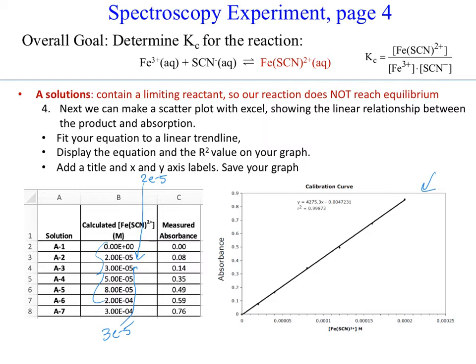On the left, what's important is to fit your data to a trend line, display your equation and your R-squared value, because we'll be using that next. Give your graph a good x-axis, y-axis, and title. I will create a separate video that goes over how to create that graph if you don't remember from a previous class.